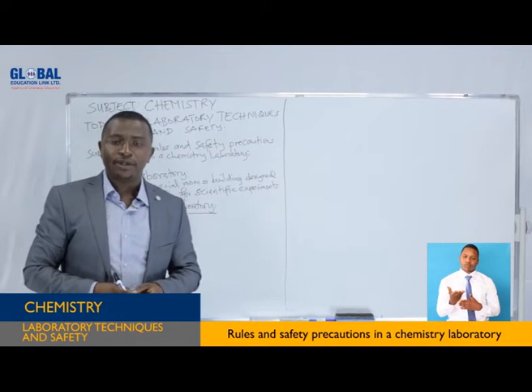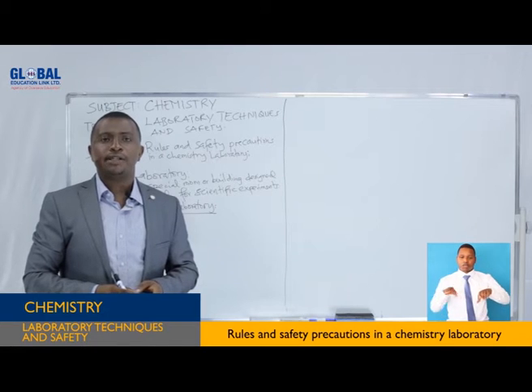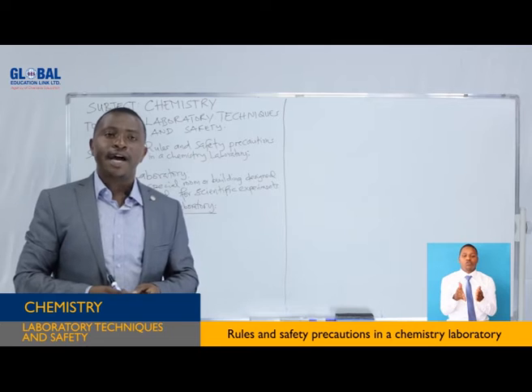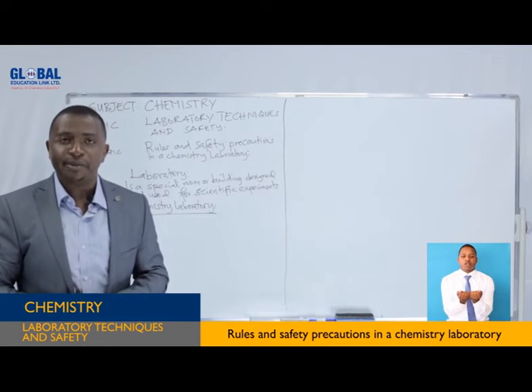What is a chemistry laboratory? A chemistry laboratory is a special room which is designed for conducting chemical experiments.